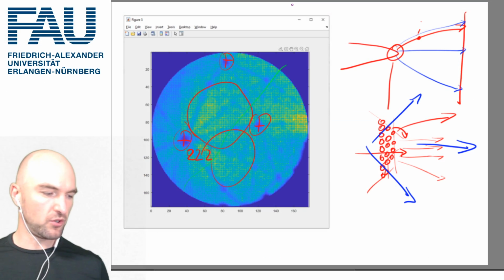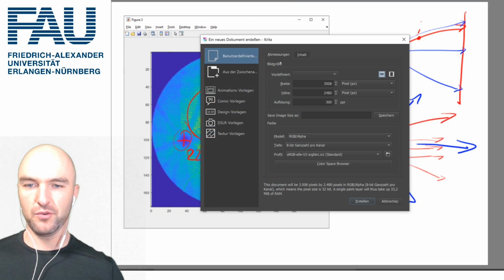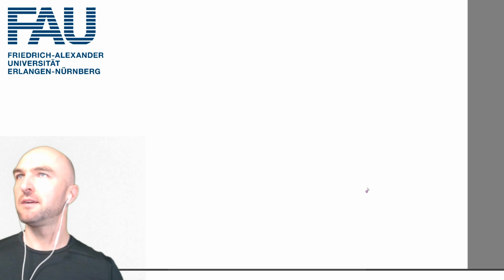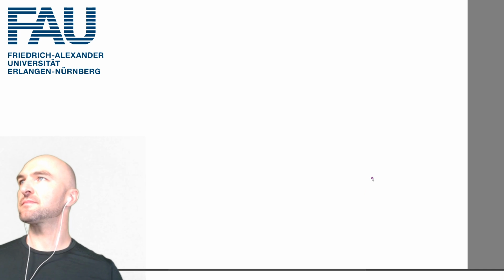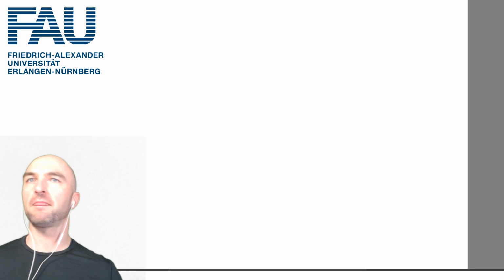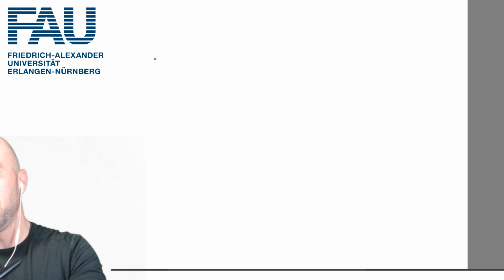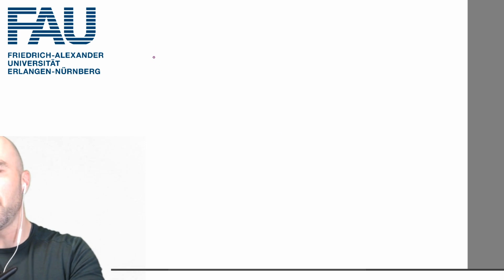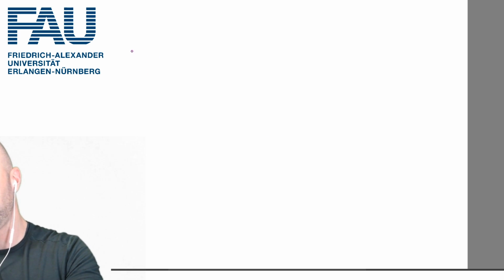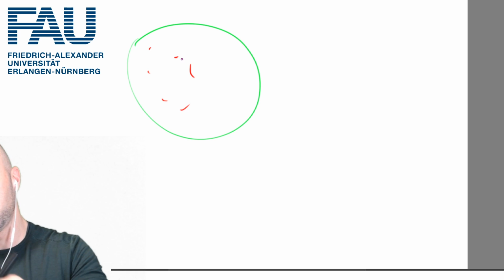And let me just create a new slide for that. So what ND means by that is essentially just imagine you have, let me just draw it as, you know, a circle.